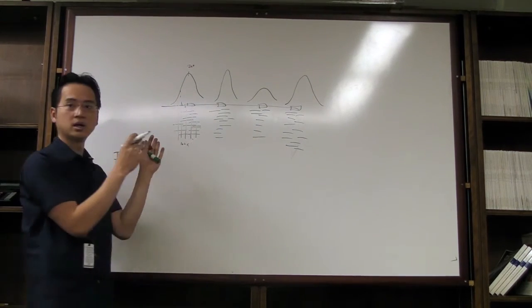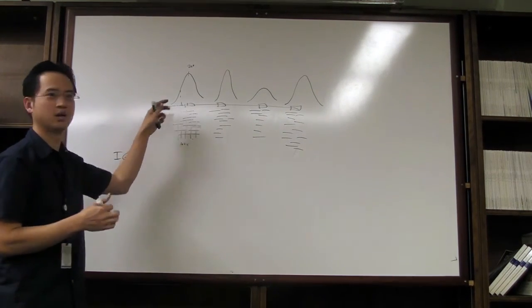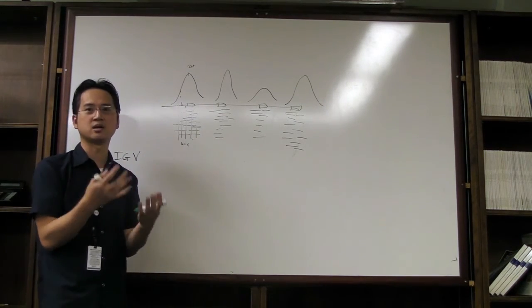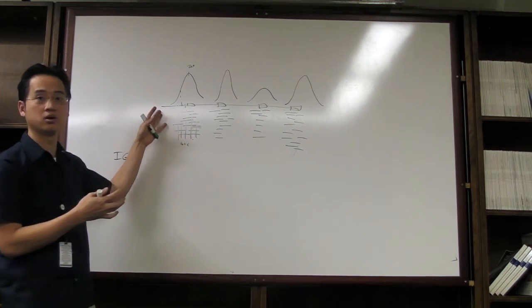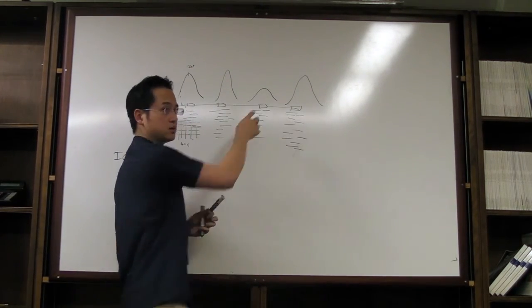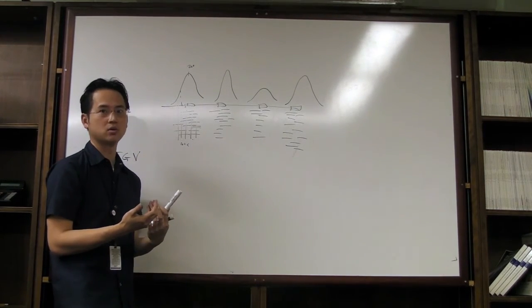So it's variable because during selection, you don't have the luxury of being able to pull down something specifically. You're left up to the will of the assay and the biology that's associated with the hybridization step. So this is what you're going to get. Sometimes you get great coverage, sometimes you get poor coverage. It's just a design of the assay that you have to take and tweak to make sure it's correct.